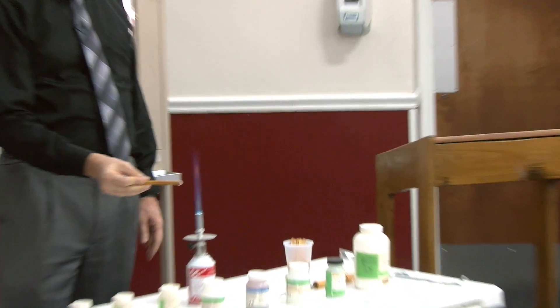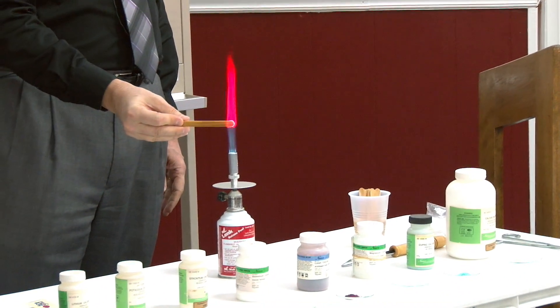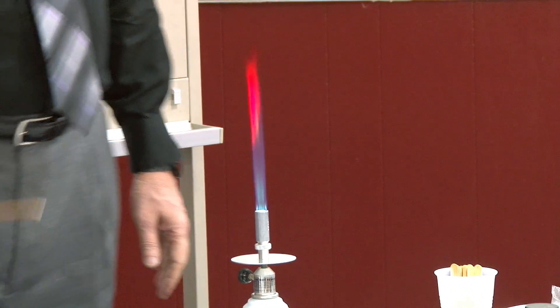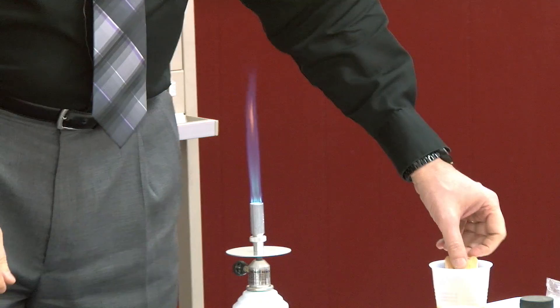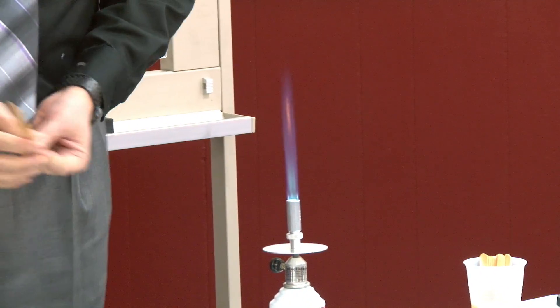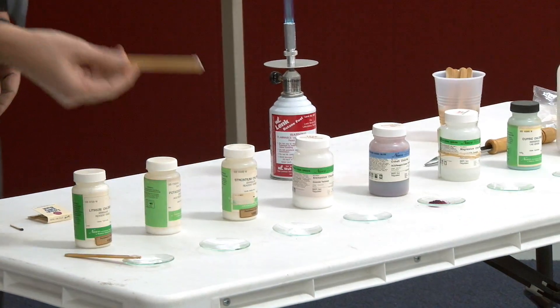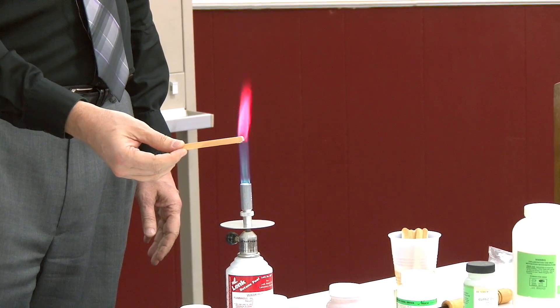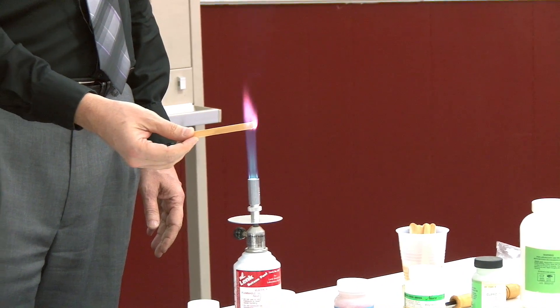Let's see what color lithium is. Now let's see — this one is potassium chloride. Kind of a lavender, huh?